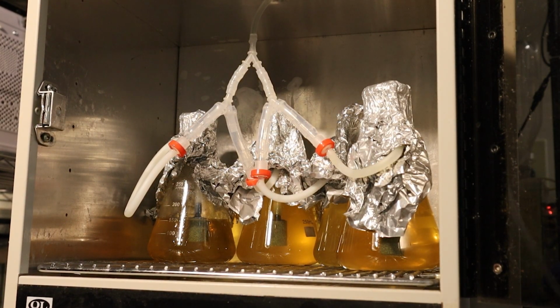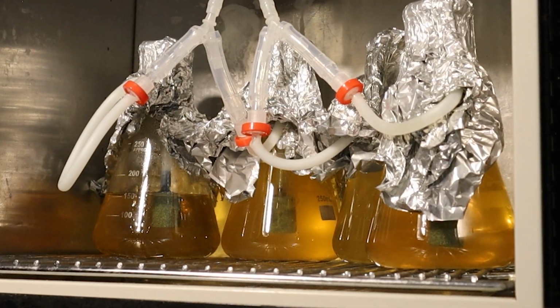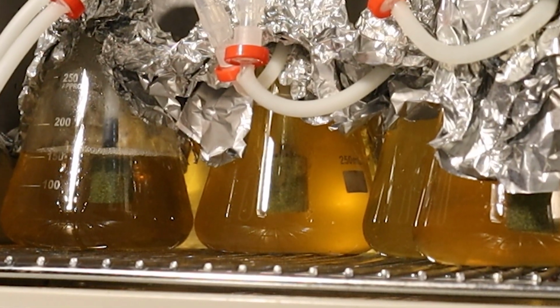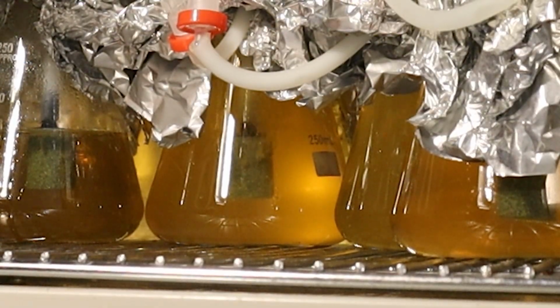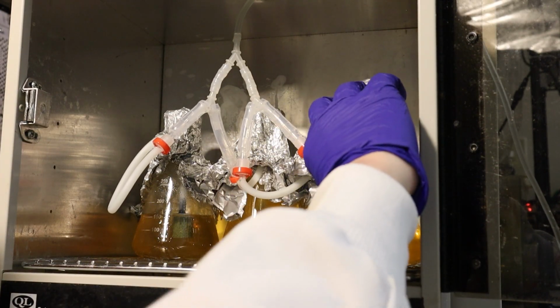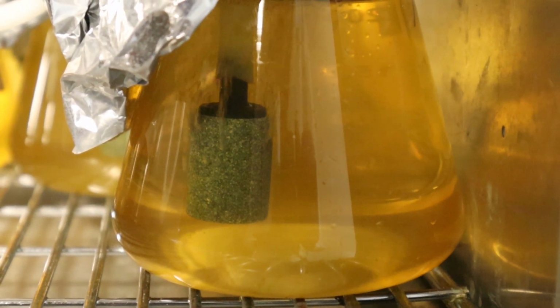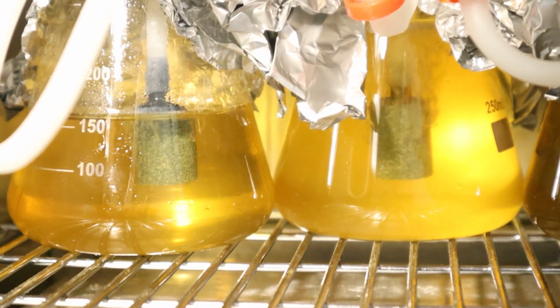Please. Please work. Oh no, no. Don't foam, please don't foam. Oh, is it working? No way. Okay, wait, I gotta lift up the foil so I can see. Yeah, look at all the stuff floating around. It's moving around, so it's causing enough circulation to get everything moving, which is what we want.